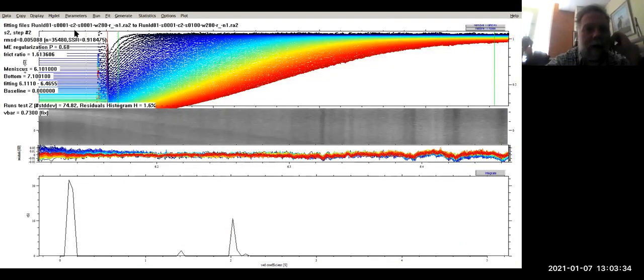with SedPhat. This is data that comes from the new machine. I found one of the original scans that Nilafar and I did when we were first getting to use this thing, and the data is lovely. I mean, look at the resolution and the smoothness in the lines. The optics are just astounding in this brand new machine.